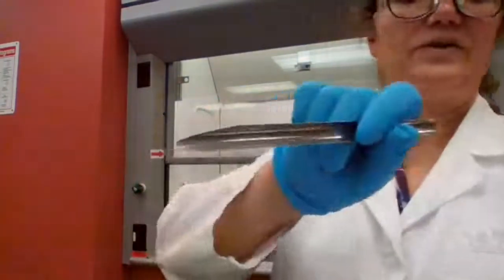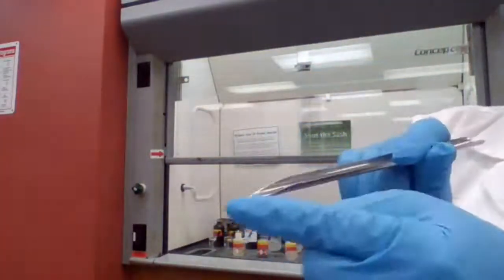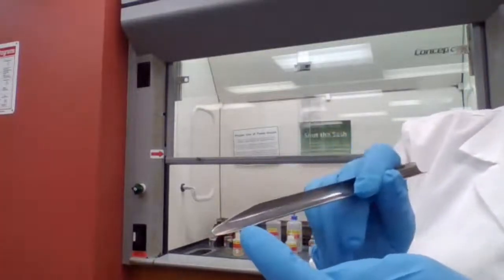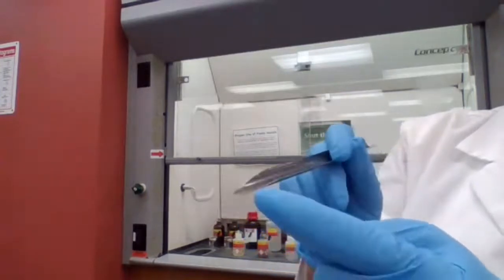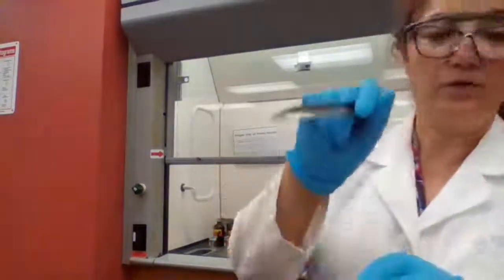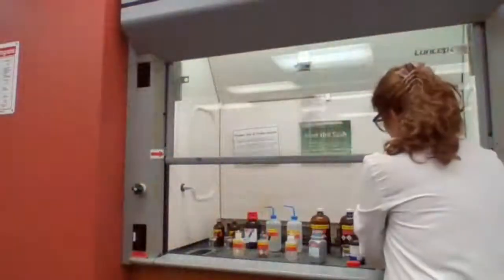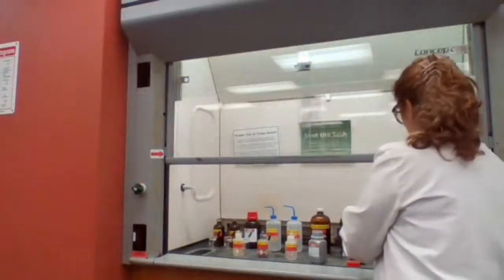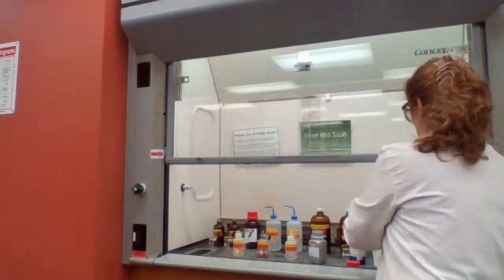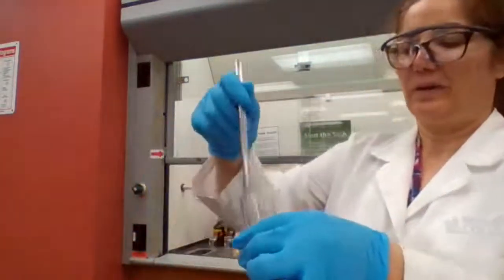If you're using this type of spatula, if you fill it up to the end of this triangle cut that you have for the spatula, that's a full spatula. Half a spatula is halfway. When I say tip of a spatula, it's just about 1/10 of it, so a very small amount. It's not a full spatula or half a spatula. So you're going to add a tip of a spatula, a small amount, into the test tube.